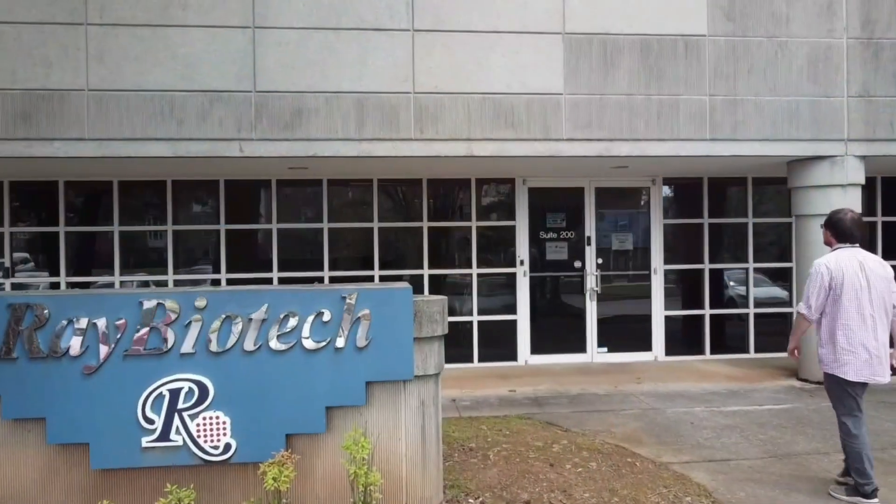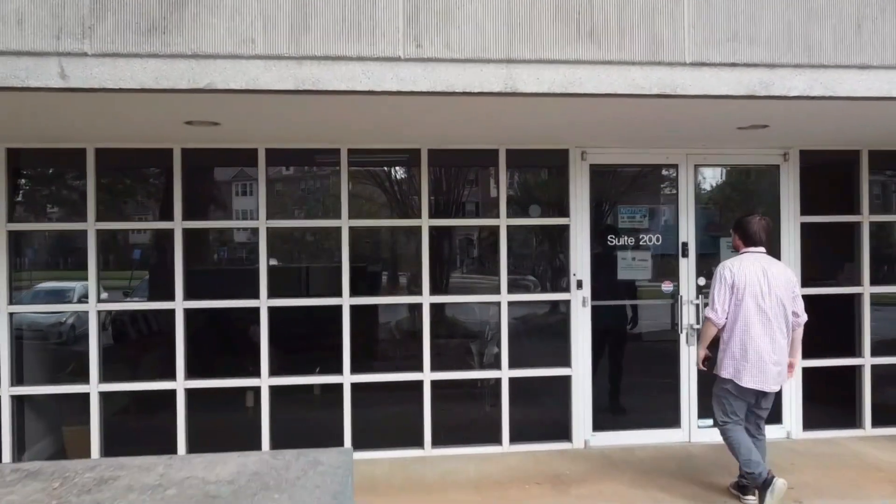Hi friends, Brittany here, former GMP grade lab trainer and current biotech demonstrator here at Ray Biotech, and we've decided to demonstrate serial dilutions.